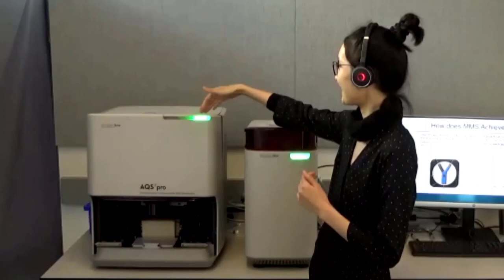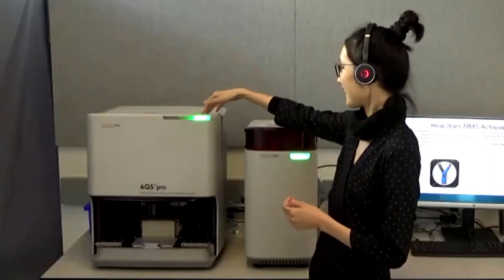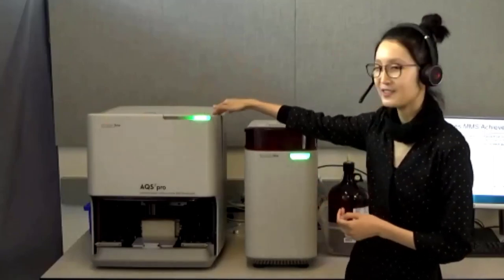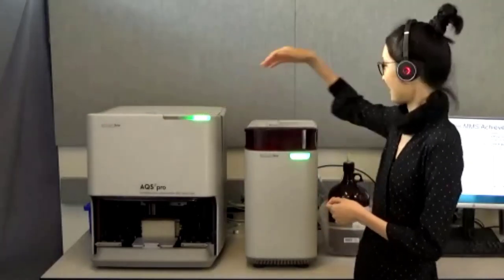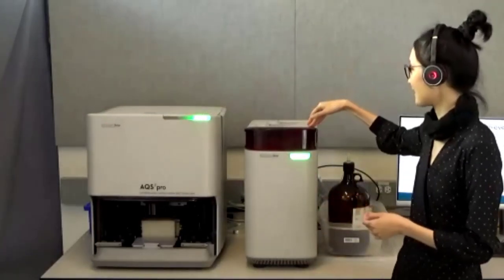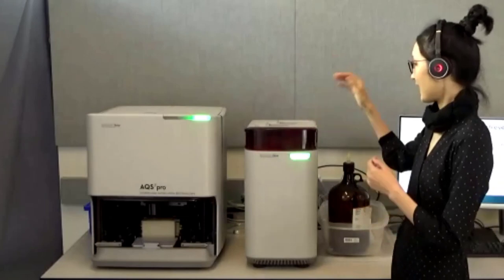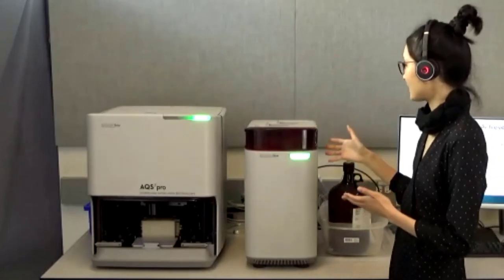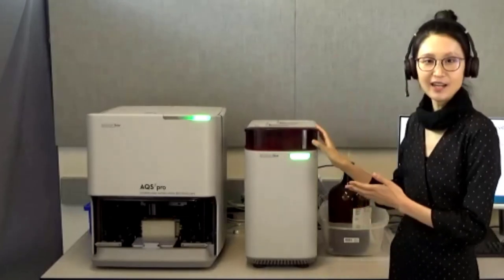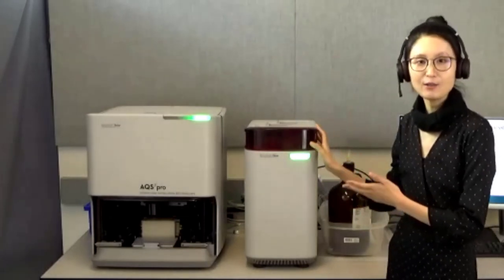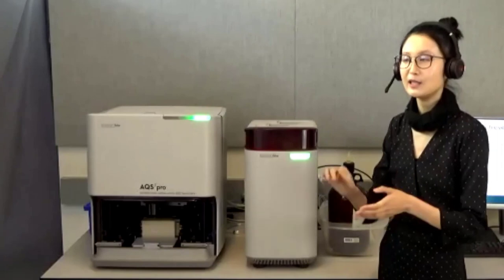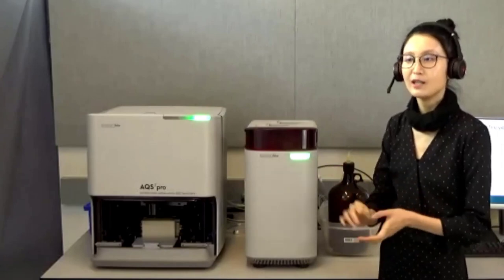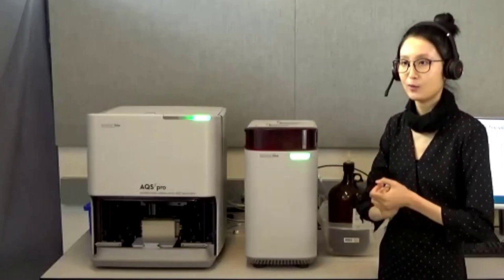Let me just introduce the hardware. This one is what we call the analyzing unit, and this one is what we call the electronic unit. The electronic unit houses the CPU, the liquid coolant, the peristaltic pump, and the vacuum pump.